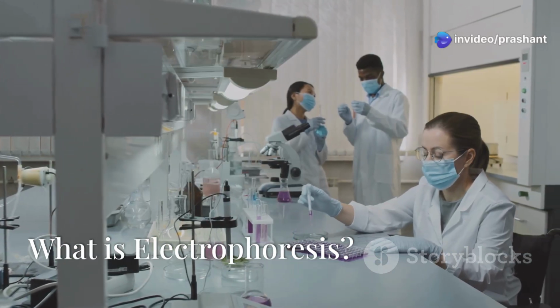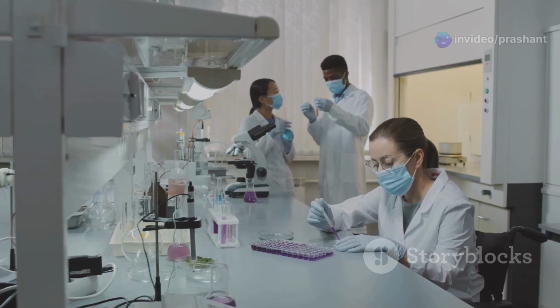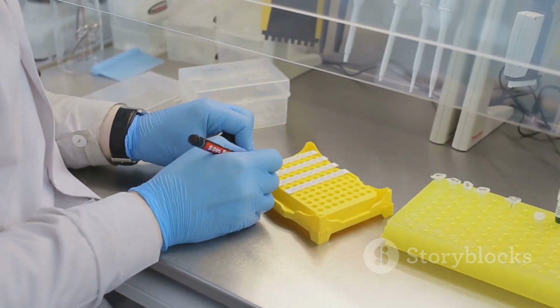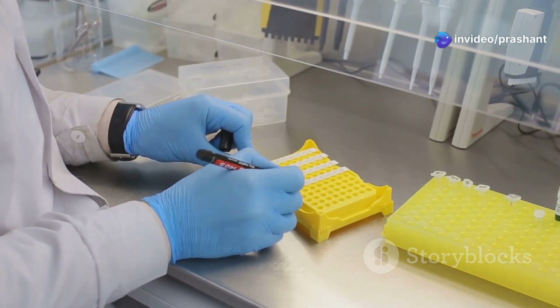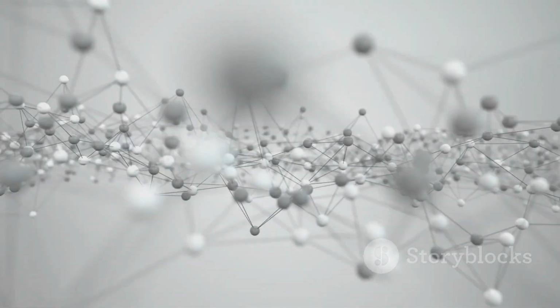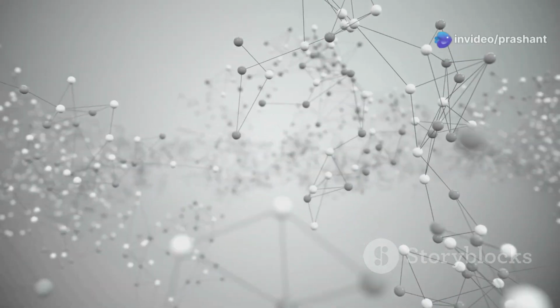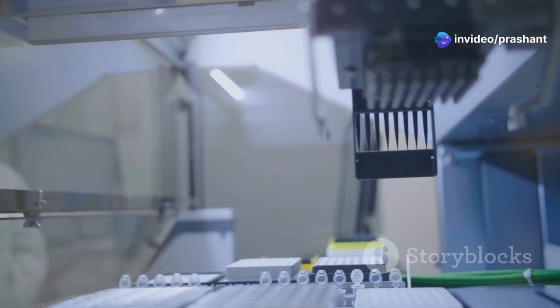Let's jump right in. Electrophoresis is an analytical technique used to separate charged particles, like proteins or nucleic acids, based on their size and charge. This process is driven by an electric field, which causes molecules to migrate at different speeds, allowing us to separate them for analysis. In simple terms, when an electric field is applied, positively charged particles migrate towards the negative electrode, and negatively charged particles move toward the positive electrode. The rate at which these particles move depends on their size, shape, and charge.